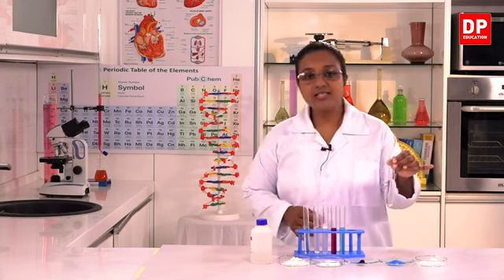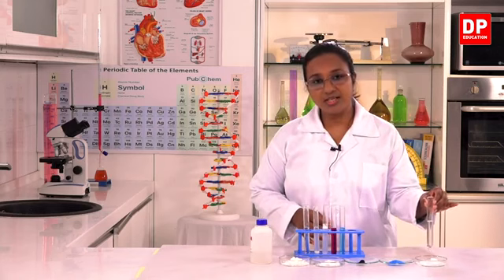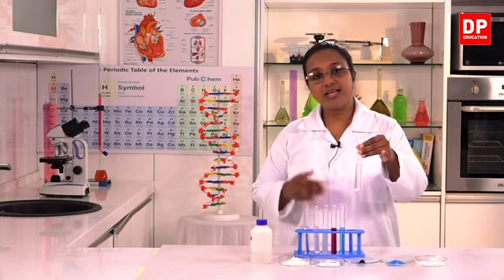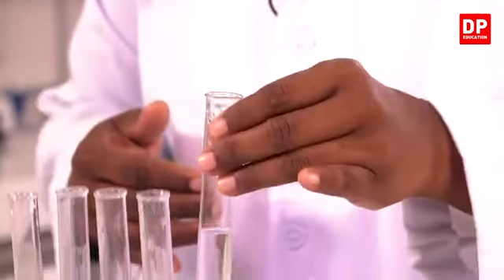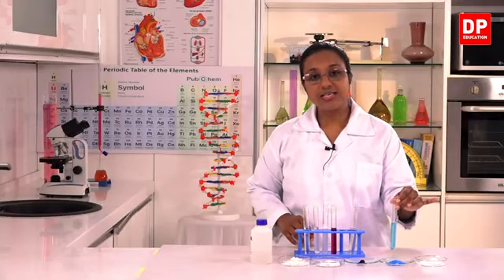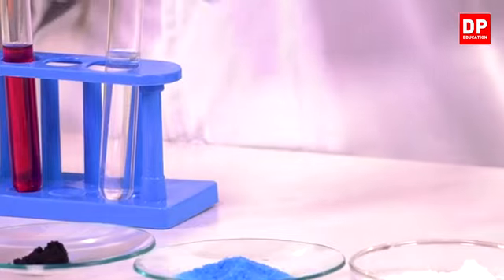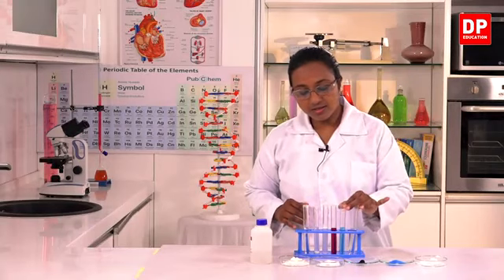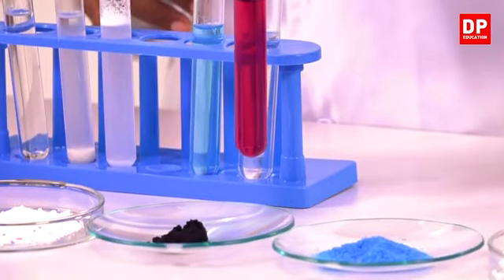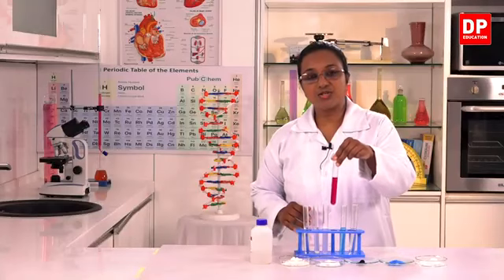Here you can see this is sodium chloride. The solid sodium chloride dissolved in water gives a clear solution. So, the transparency is there. It's a transparent clear solution. Then we have the copper sulfate solution. Here you can see that is also a blue color transparent clear solution. Again we have the third solution here, that is potassium permanganate dissolved in water. That is a purple color clear solution, and that is also transparent.